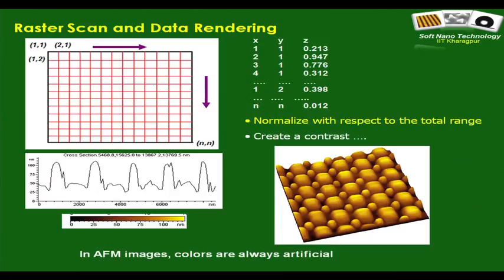So this is one more thing that I will highlight before I end and break for today. This is the type of data you typically generate. There will be certain minus values, some will be plus, some will be minus, whatever. Again, something I missed out, and 1 1 should not have any value, 1 1 will be 0 0 0, right. So this is how you split up your zone of interest, and as I have mentioned, you go on tracking how much the scanner is moving up and down to which the cantilever is mounted. You generate this data file.